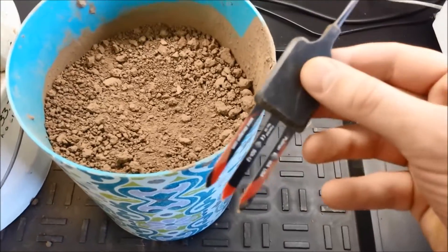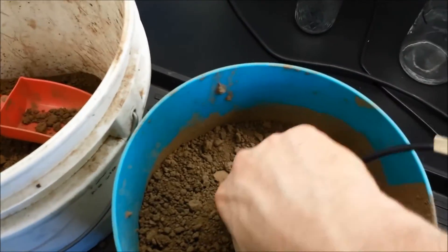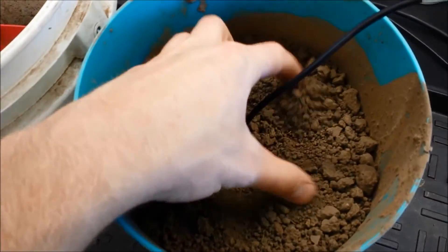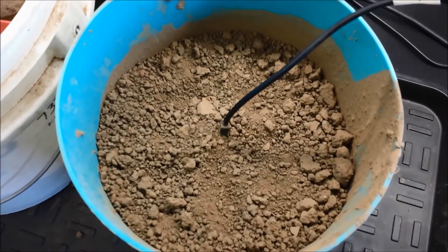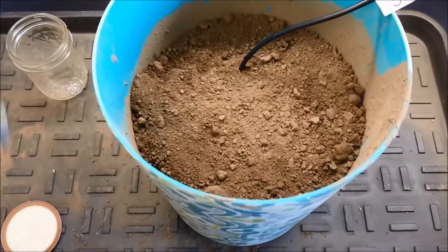Next, insert the sensor into the soil. Make sure the sensor is fully inserted into the soil, including the black plastic part. Ensure that the sensor is surrounded by continuous soil for a radius of 5 centimeters from the sensing portion. Once fully inserted, the volumetric water content and electrical conductivity can be recorded.